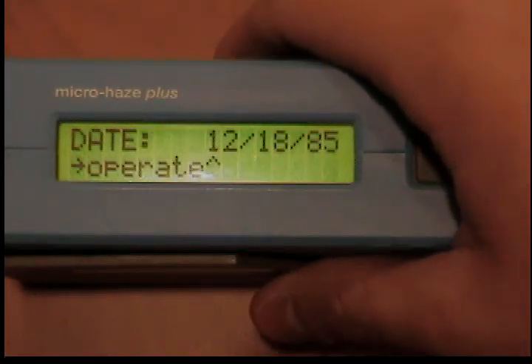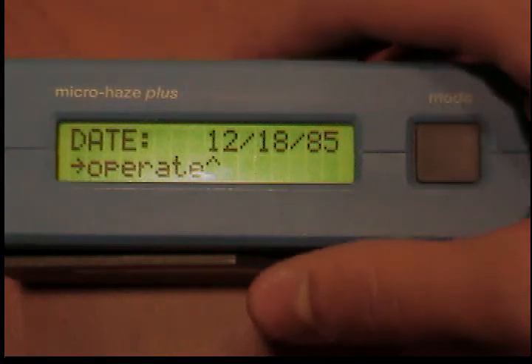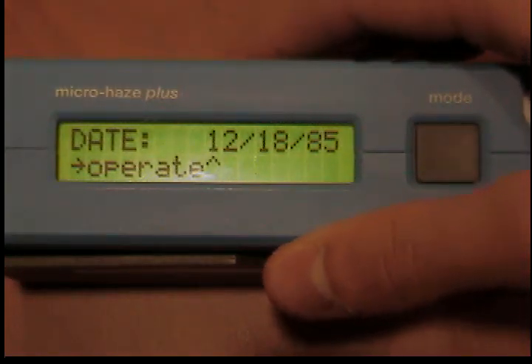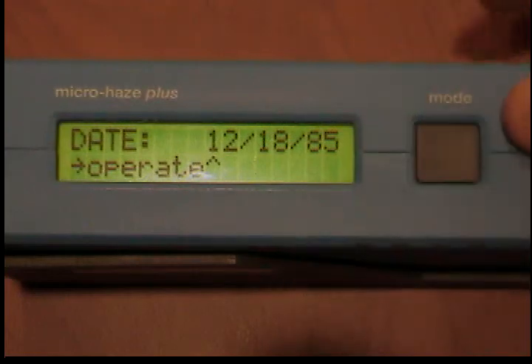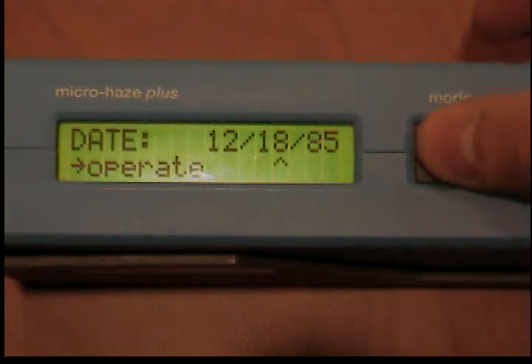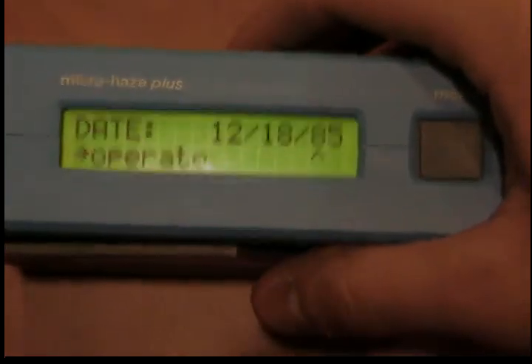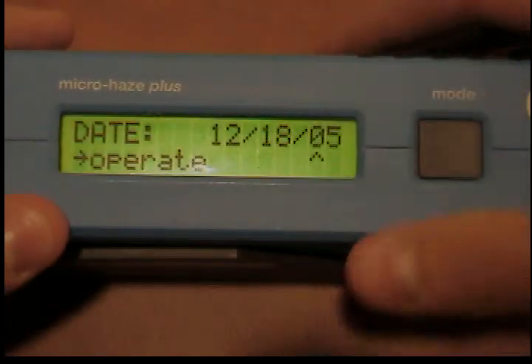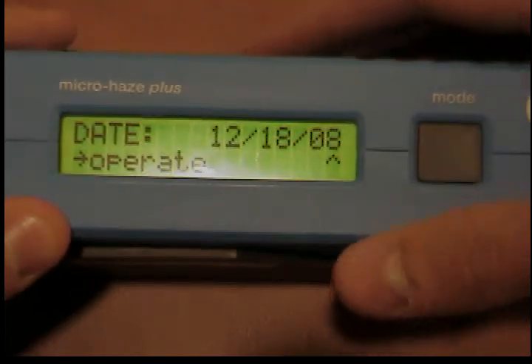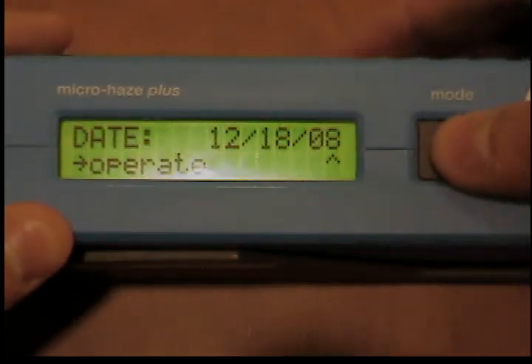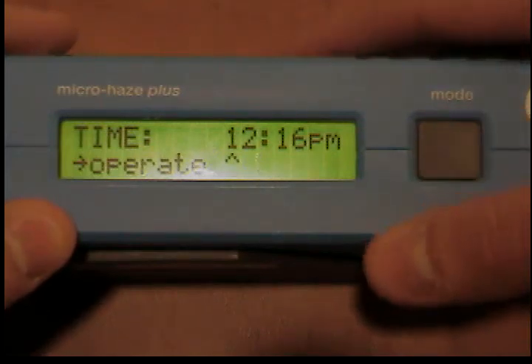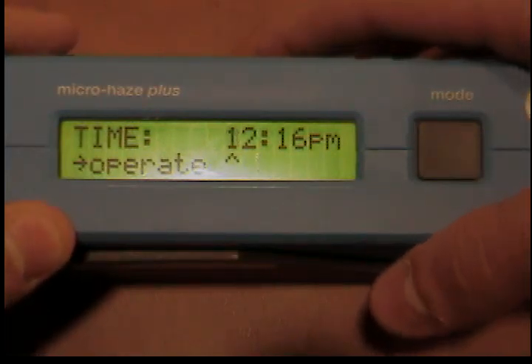The first digit is indicated by the arrow. You can press the operate button to cycle through different values for the selected digit. Press the mode button to confirm the desired value for the selected digit and the arrow will jump to the next digit. When the last digit has been confirmed, the time will be displayed. Time will be changed in the same manner as the date. When the last digit has been changed, the new data will appear on the display. This new data can be accepted with the mode button or discarded with the operate button, in cases of input errors, for example.